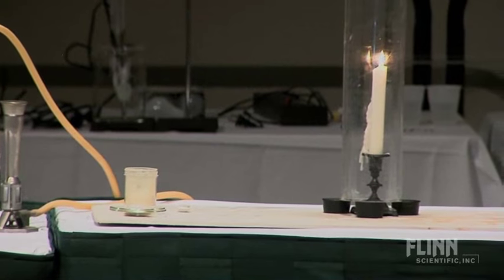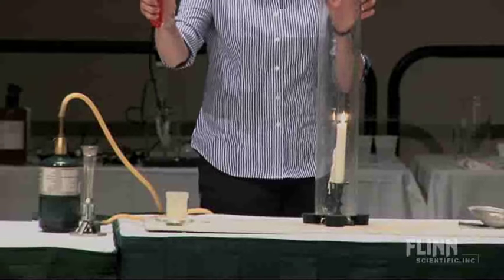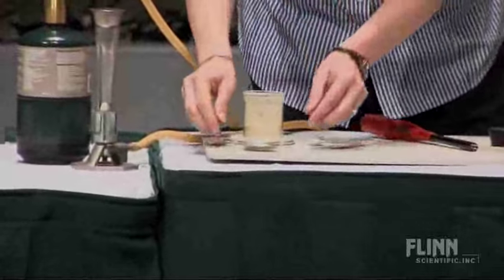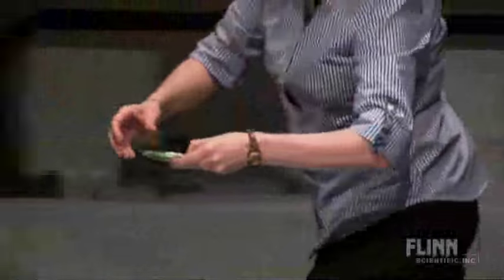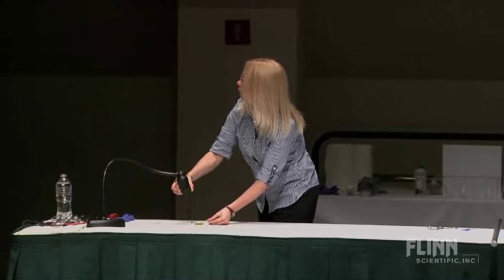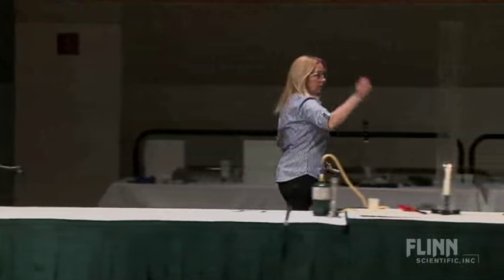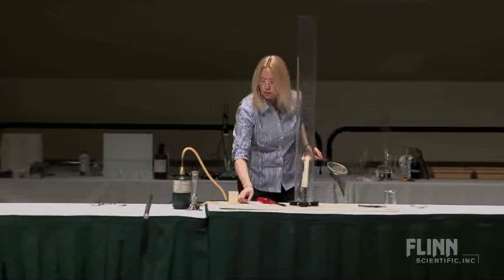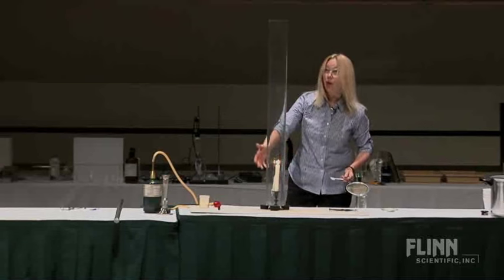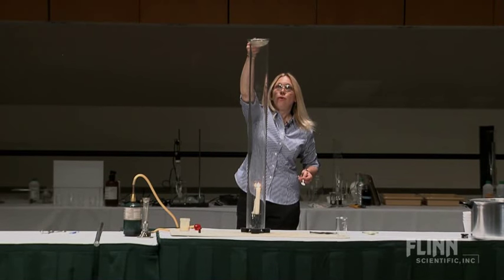If you use a little aim-and-flame and try to light some lycopodium, you can maybe get it to char just ever so slightly on the top. I've got three stoppers down here at the bottom just to lift it up, and I've got a nice 'Ode to Michael Faraday' candle in there. If we can bring the lights down just a hair.